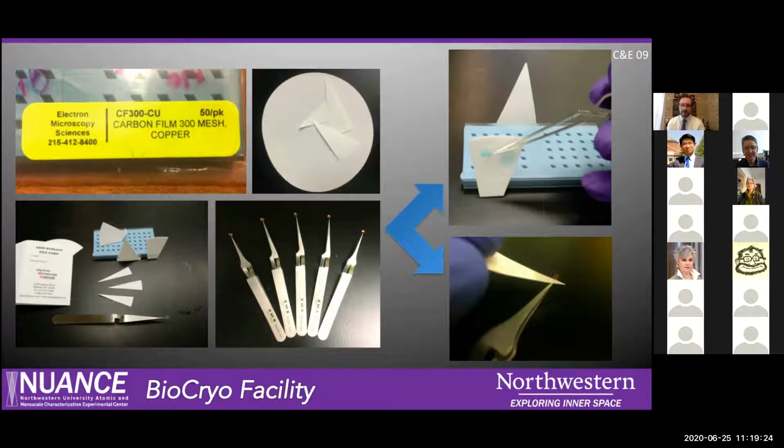Sorry, back to Charlene's point. In Charlene's technique on the top, it's really cool how you can mount the filter paper with your grid box and blot your grid. Then you're only handling the grid and not the filter paper.